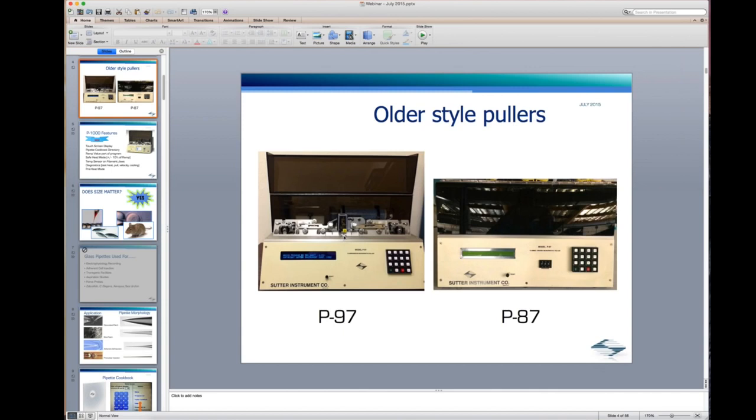If you want to control for the humidity, basically what's happening is the humidity is causing the cooling of the glass to be variable. When you have moisture, say you're sweating, you're accelerating your cooling rate. And that happens on the glass, around the glass too. If there's moisture around, it's going to change the rate of cooling of the glass. And so that's the reason we have this humidity control chamber, and this gets purged with dry air before and after the pull.